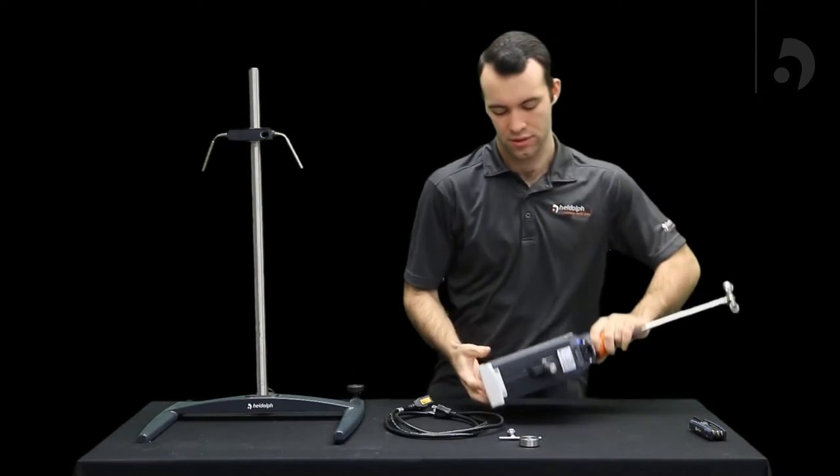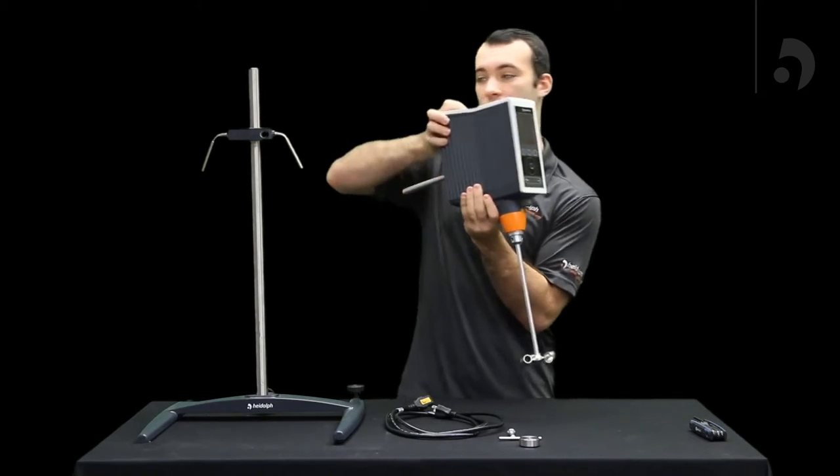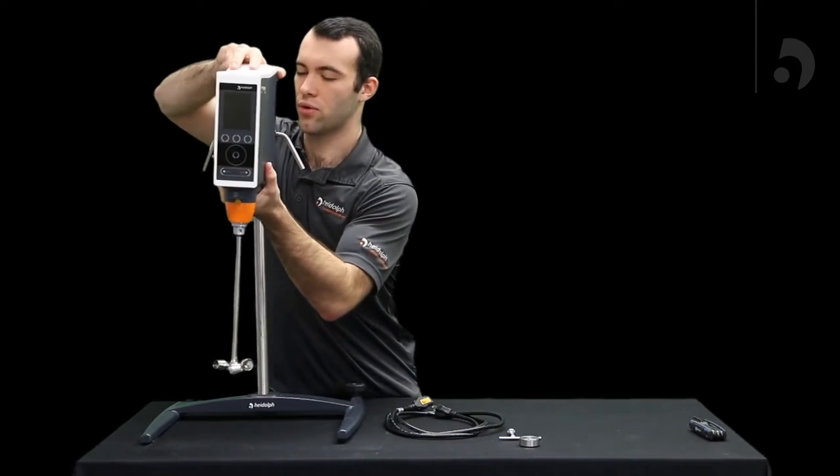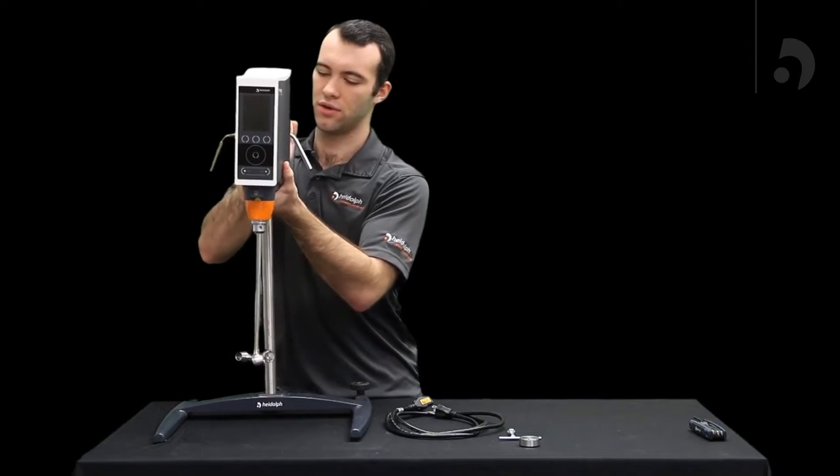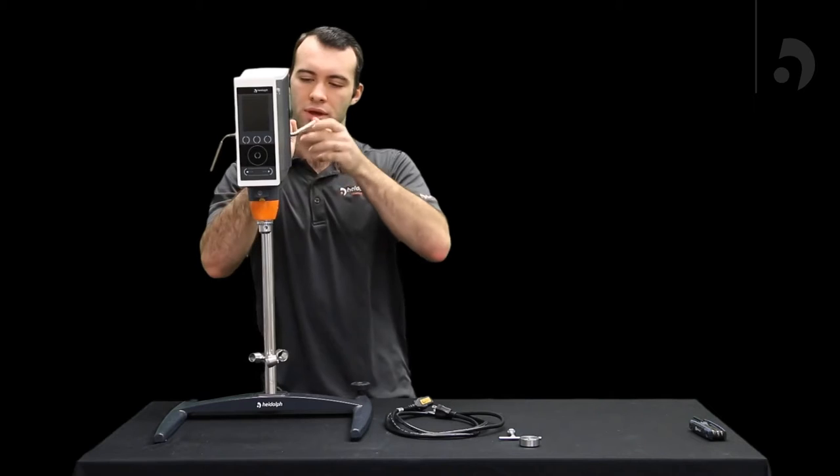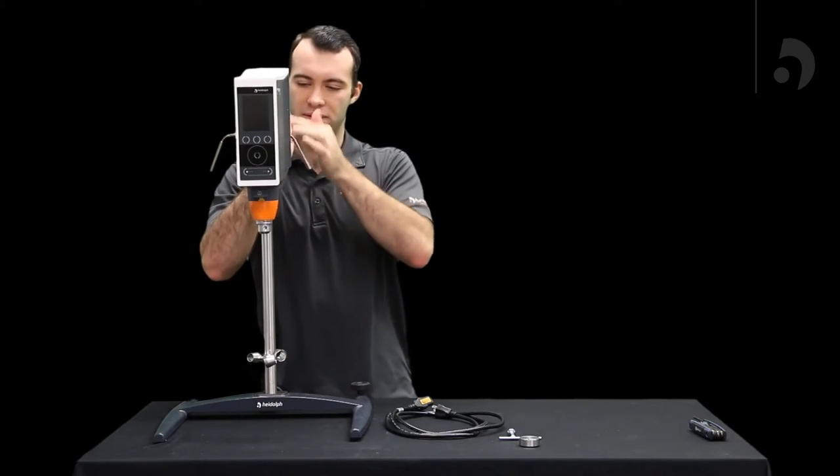Once that's on, take your HITORQ, put it through the other hole in the universal clamp, and using the other side tighten it very tight.